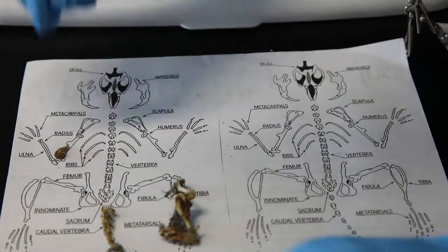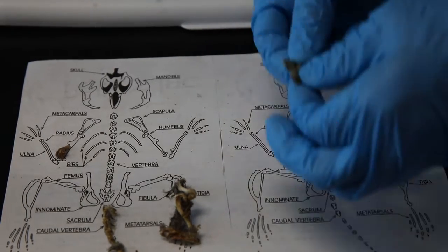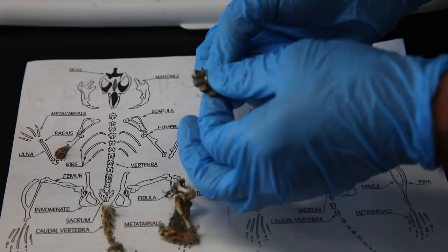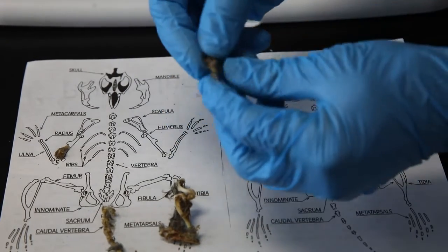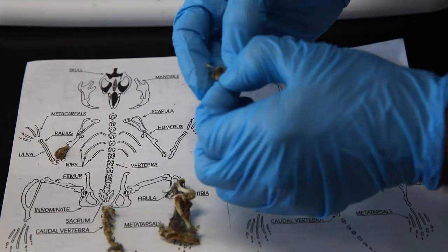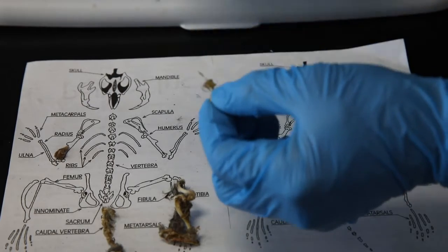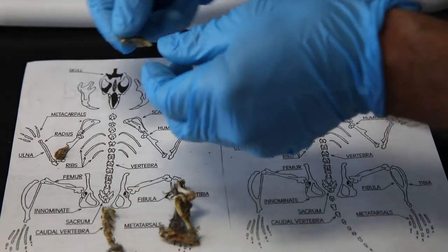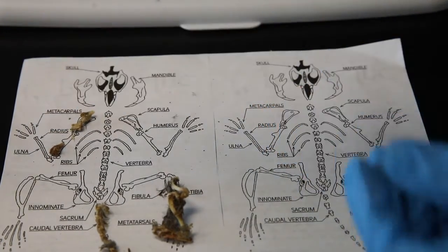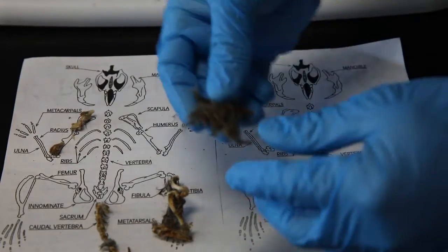So you don't have to use gloves because the pellet we bought for you comes from a company that sterilizes it. Oh, boy. Dave got an owl pellet out of my backyard. Uh-oh. So, in Hemet and San Jacinto, you have owls. If you have an owl in your neighborhood, go stand or walk around the base of that tree, and you might just see a little glob of hair and bones. That's an owl pellet. But it hasn't been sterilized. Dave's going to town on this thing. It's like the operation game we used to have in the Lions Den.